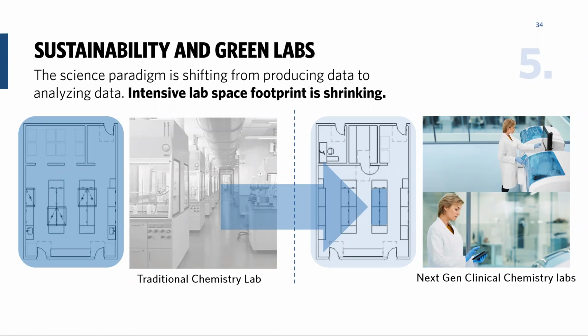So the lab technicians are less hands-on doing the experiment and producing data, and doing more of analyzing them, which is really what I think our brain should do. And this technology is already in the market and is being used for COVID testing.